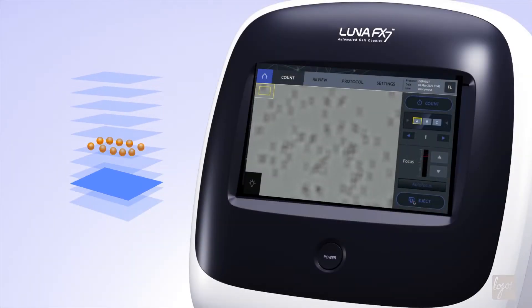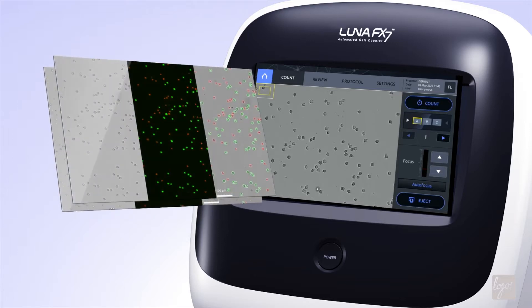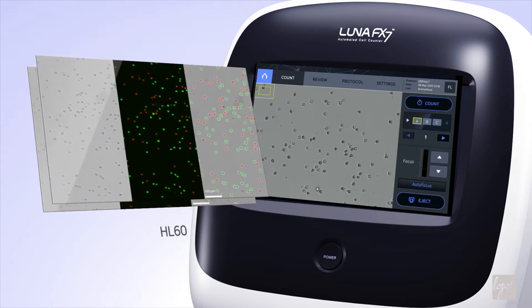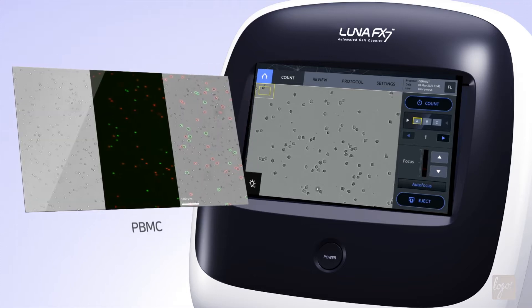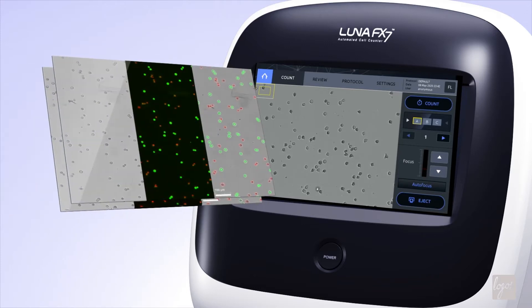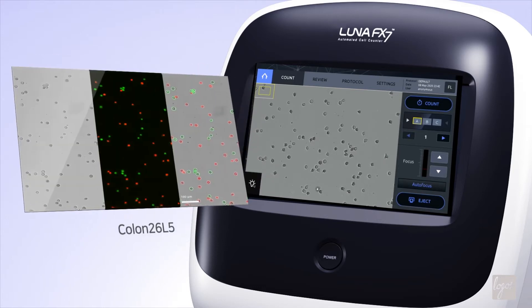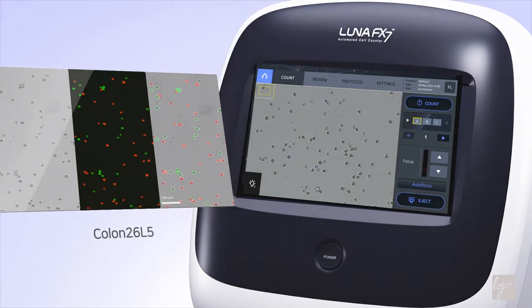The LUNA FX7's quick and reliable autofocusing ability further simplifies operation. Enhanced optics produce clearer, more uniform images that increase detection sensitivity and the dynamic range, while the upgraded counting algorithm more accurately distinguishes viable and non-viable cells within aggregates.